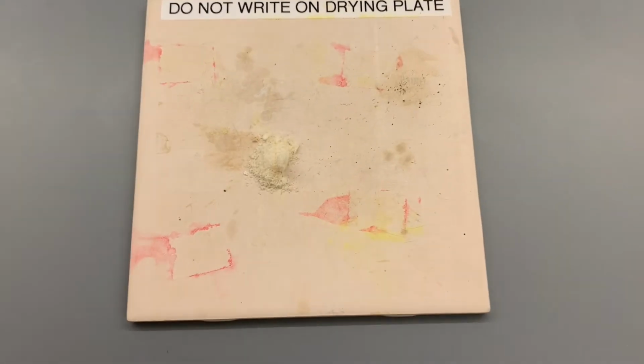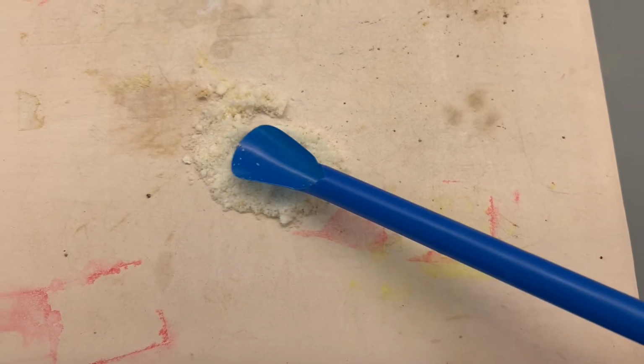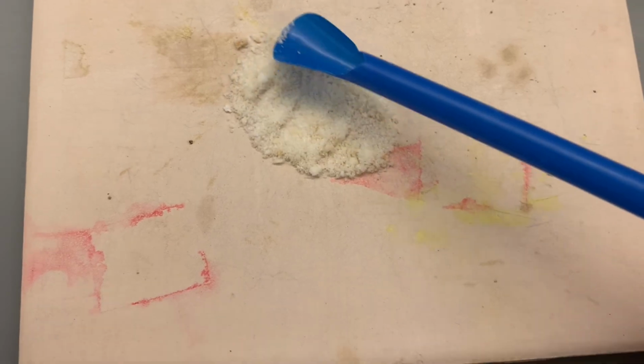Prior to going into the Mel Temp, your solid should be completely dry. To ensure this, let your solid dry for as long as possible and spread into a thin layer on your drying plate at the end of lab, once your product has been synthesized.